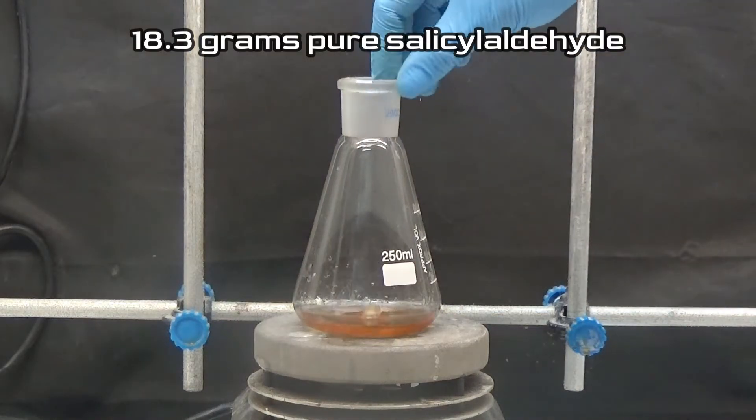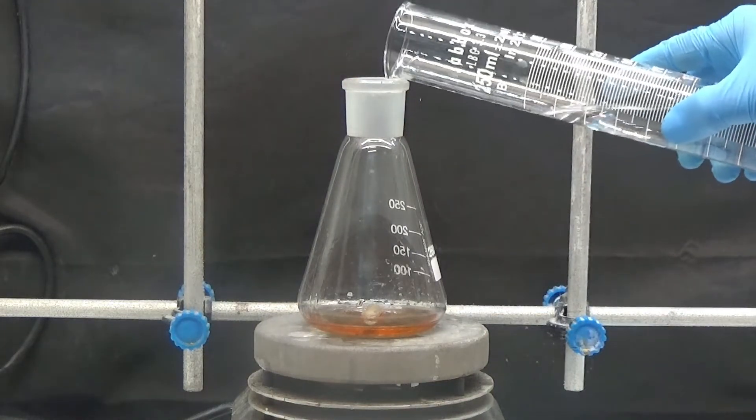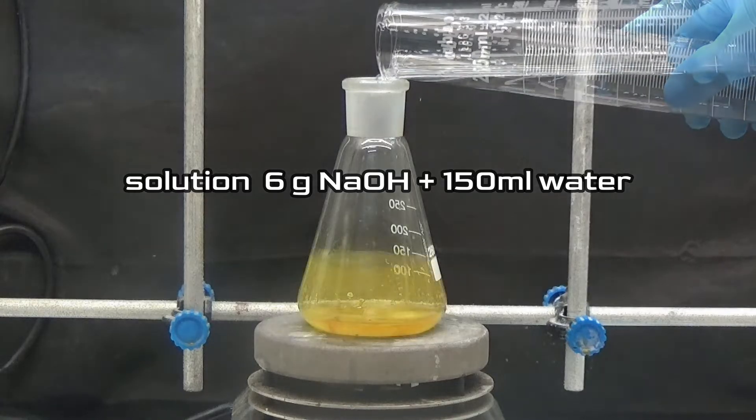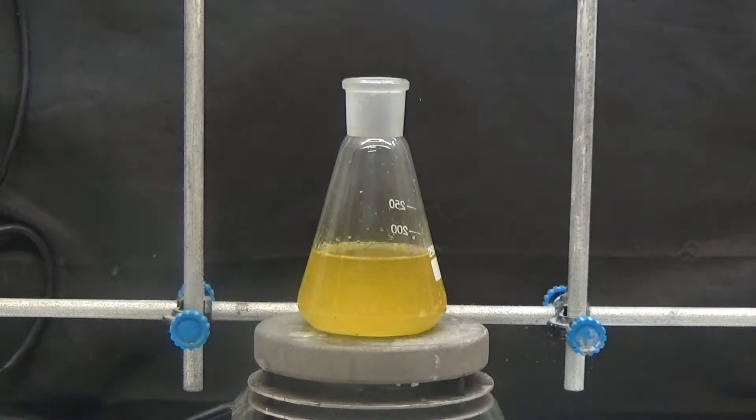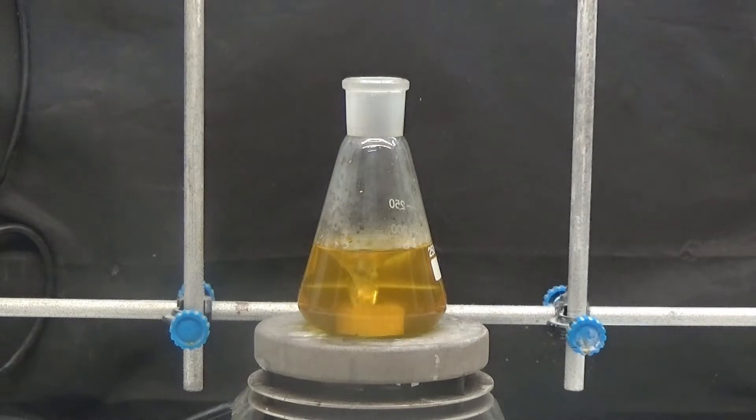Put the flask on a stir plate and add a solution of 6 grams of sodium hydroxide in 150 milliliters of water. Stir for a few minutes until the solution is homogeneous.